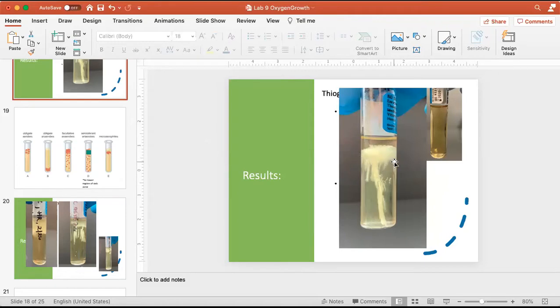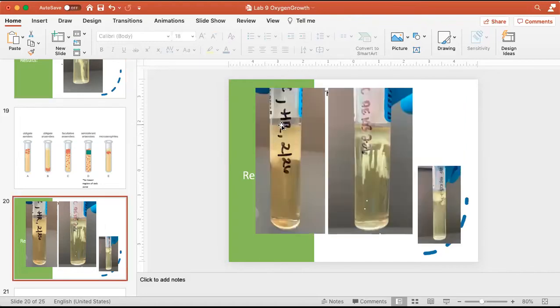These are cells, and they're growing right here, but they're not growing up at the top of the oxic zone where the highest amounts of oxygen are. This organism is growing up to the top, all the way through the oxic zone. Now, it's hard to see, but can you see this white streak right here?